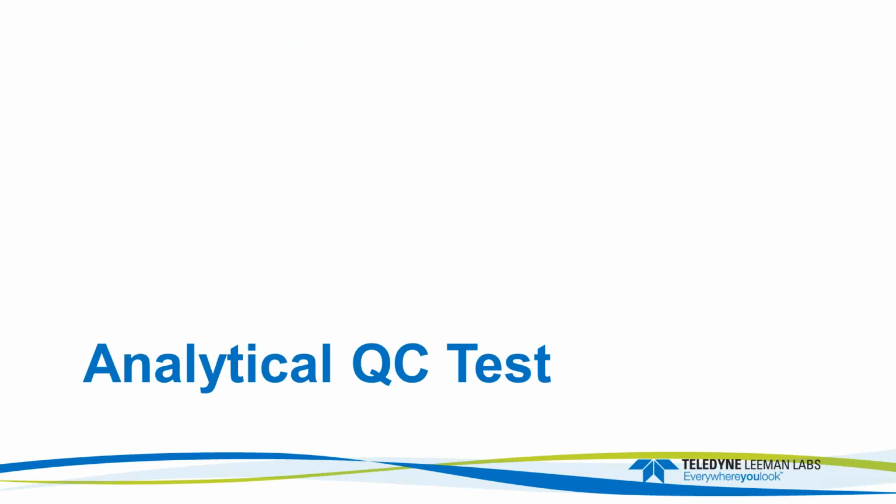Okay. Then finally, probably the more common test that people would apply would be the analytical QC test, or what we used to call the daily QC test. If I am having a problem with an instrument either in my lab or if I'm visiting a user site, as soon as something's wrong, I don't jump in and do the mercury and RF tests right off the bat. I tend to do this analytical test first, and then look at some of the common problem things that we'll look at in a bit before I go into the mercury and RF tests or Argon tests.